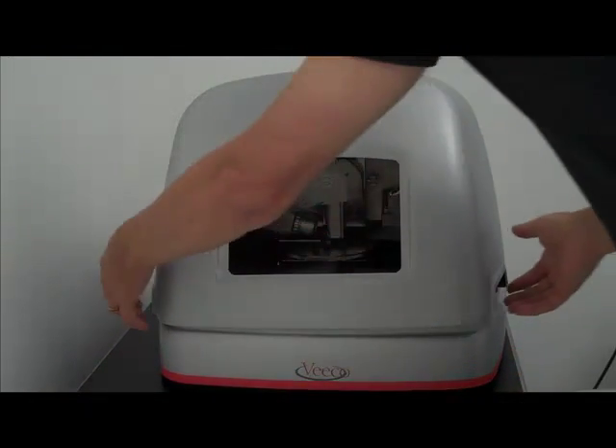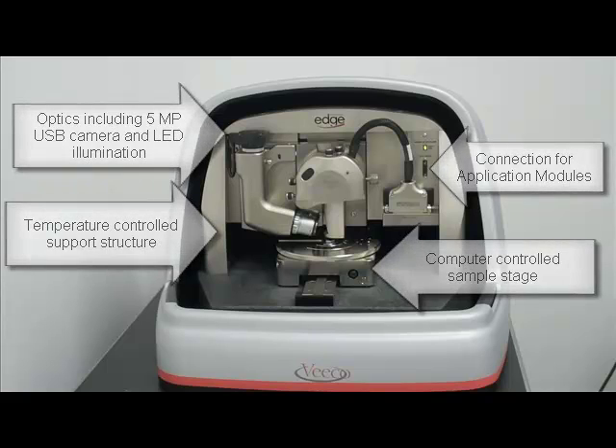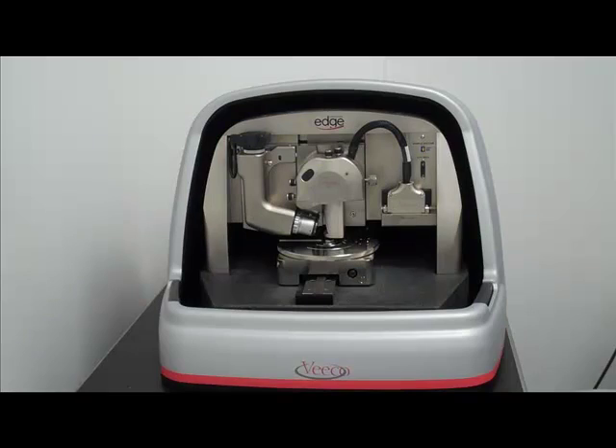Here we see the Dimension Edge sitting on an air table. We can simply pull the front cover off and look at the main components: optics, the support structure, connections for application modules, and the computer-controlled stage allowing a 150mm by 150mm inspectable area. We also see the closed loop scanner, dead center in the middle, coming from the Icon.